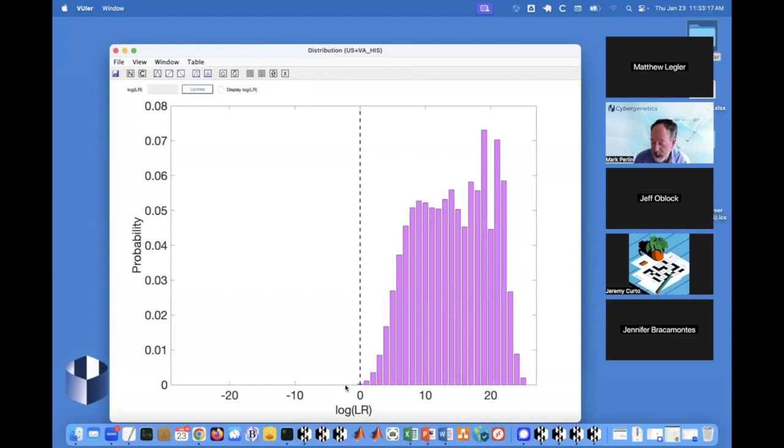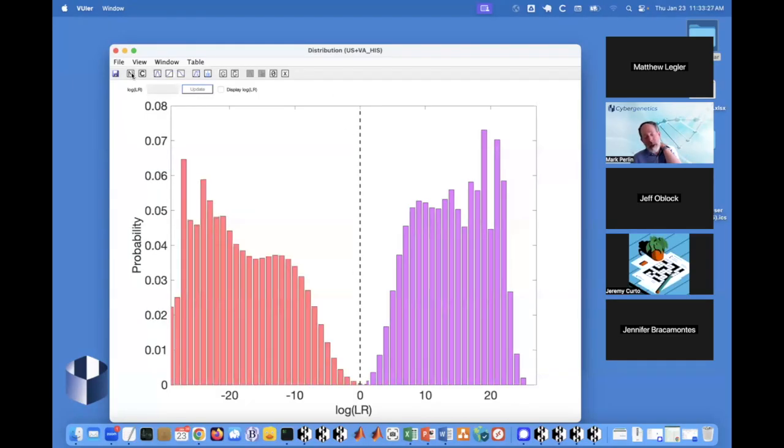So we see this duality: anything you can do for inclusionary results, turn on the left curve, you can also do for exclusionary results using the contributor distribution on the right. And we use this all the time. We don't know where the cases are coming from or what the questions are going to be, and we want to be able to report match statistics and error rates, basically everything.